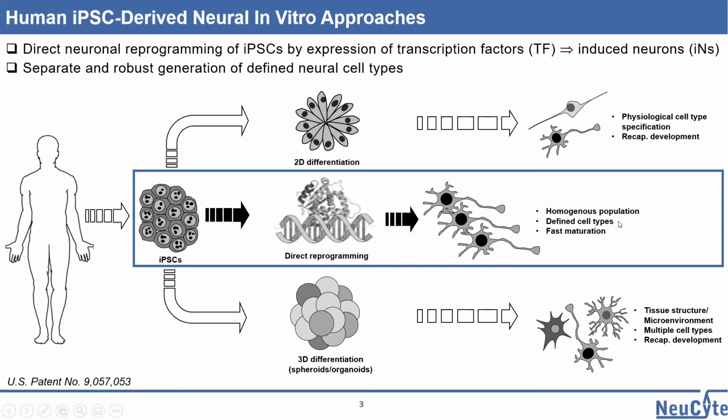Also, the population that you produce is, for each of the individual cells, pretty much at the same maturation stage. Whereas in stepwise differentiation protocols, you always have some more or less differentiated cells, some late stage progenitor cells, and already some neurons that have capabilities of firing. With a direct reprogramming approach, you pretty much have every neuron at the same stage of maturation, because the transcription factor applies a dominant stimulus overwriting the existing transcriptional programs, and therefore leading to, I would say, a synchronized, but cell cycle independent, maturation stage. This process itself also speeds up the maturation to achieve functional neuronal identity.